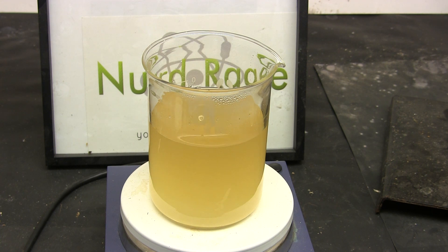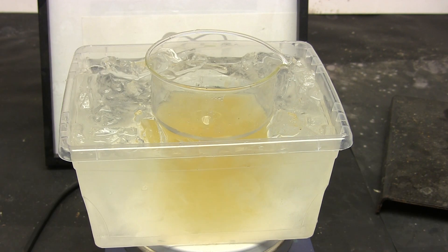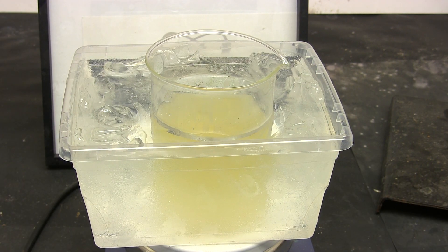As the mixture cools, the sodium sulfate will crystallize out. To remove even more sodium sulfate and drive the reaction forward, we'll place the beaker in an ice bath. Sodium sulfate has dramatically reduced solubility near freezing temperatures.